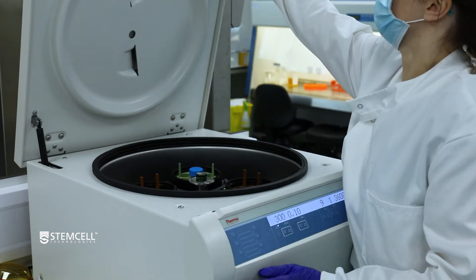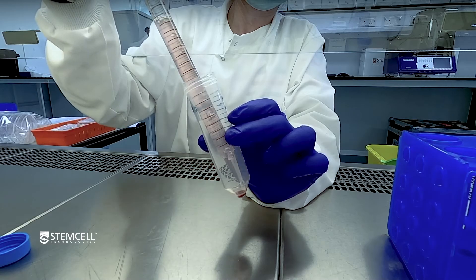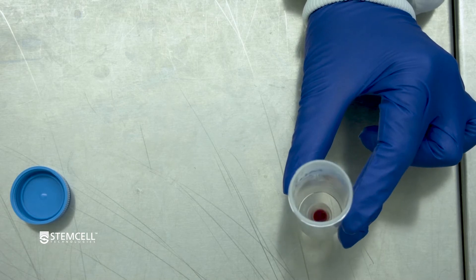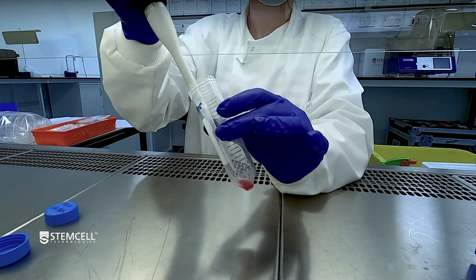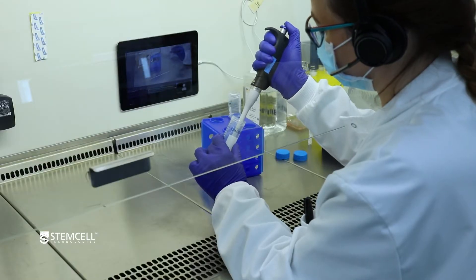Centrifuge the cell suspension at 300 times G for 10 minutes. Carefully remove and discard the supernatant without disturbing the pellet. Gently tap the tube to dissociate the cell pellet. Resuspend the cells in approximately 500 microliters of PBS containing 2% FBS.